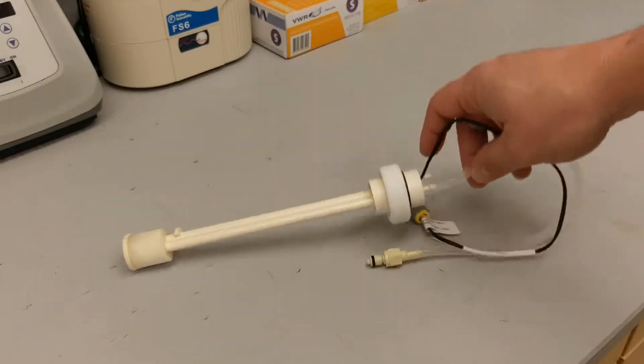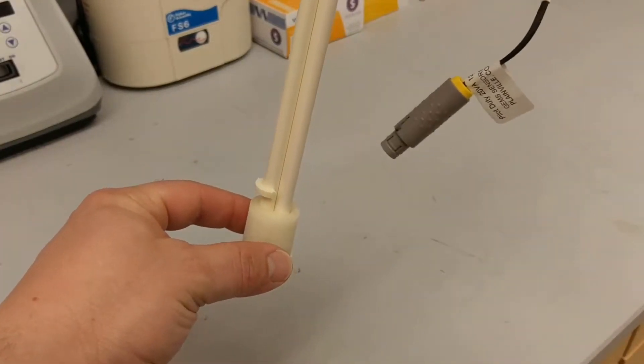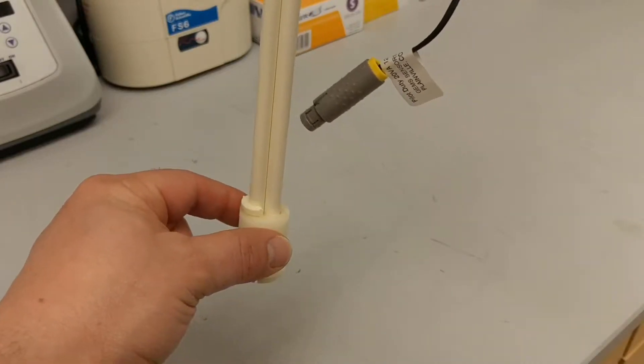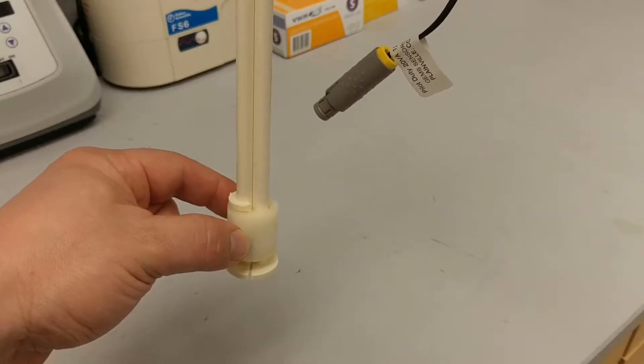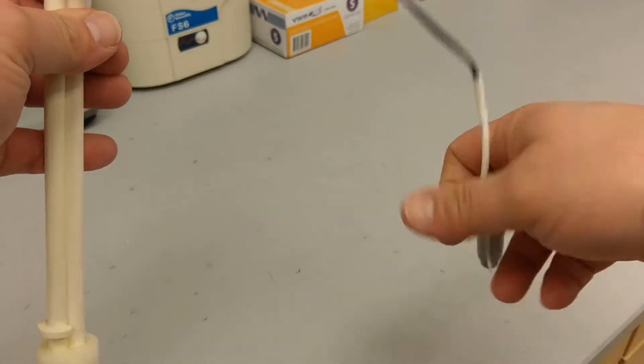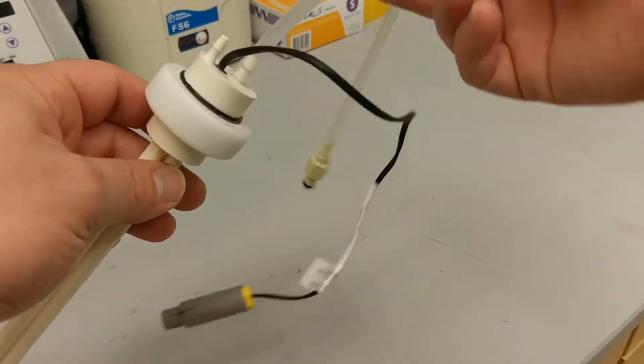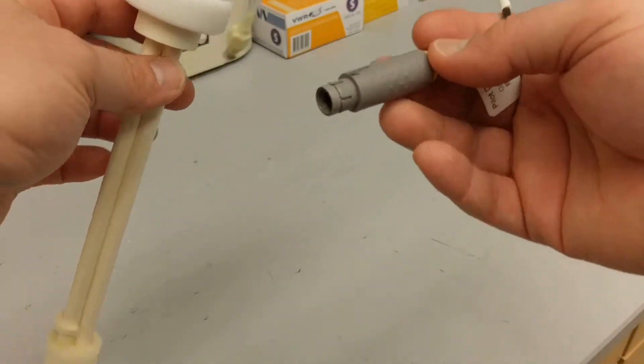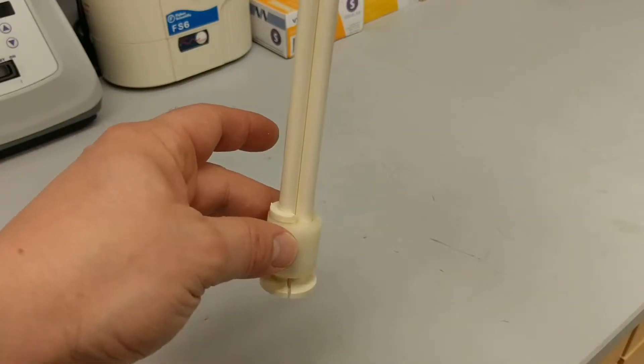It basically has a float at the bottom, so that when the float is in a container full of fluid, this float portion will raise. What happens then is that will complete the circuit, and the machine will read that the tank is full through this connector. This line is where the fluid passes through, and this line is just the circuit telling the machine that it's full when the float is in the up position.